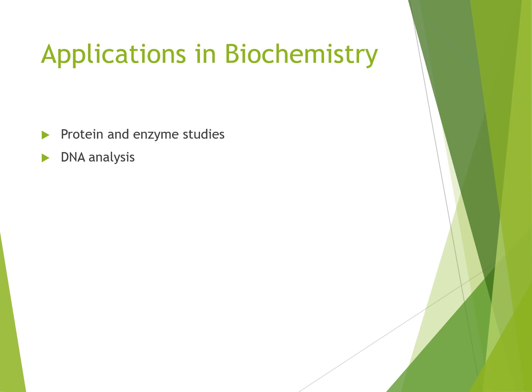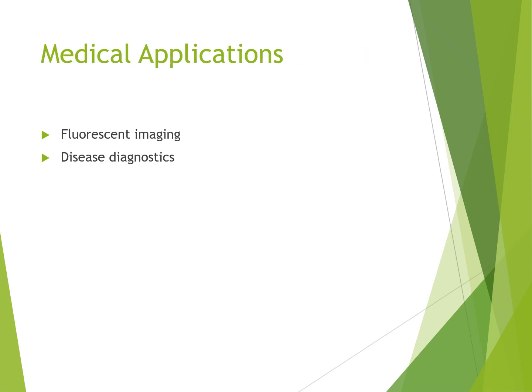It is a very powerful technique used to study biological molecules like proteins and enzymes, and it is a very sensitive technique that can be used in DNA analysis. It can be used in imaging and different diagnosis patterns, and it is a very helpful and powerful tool.